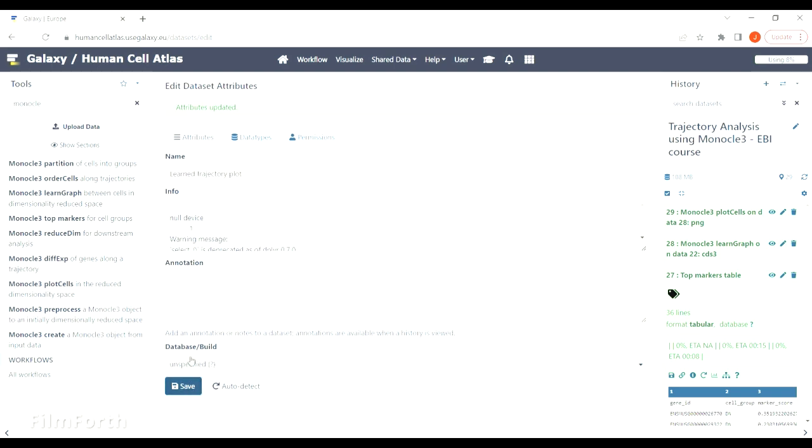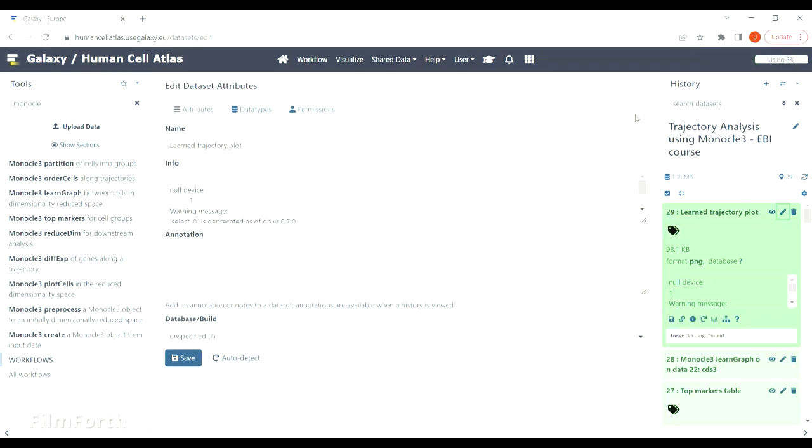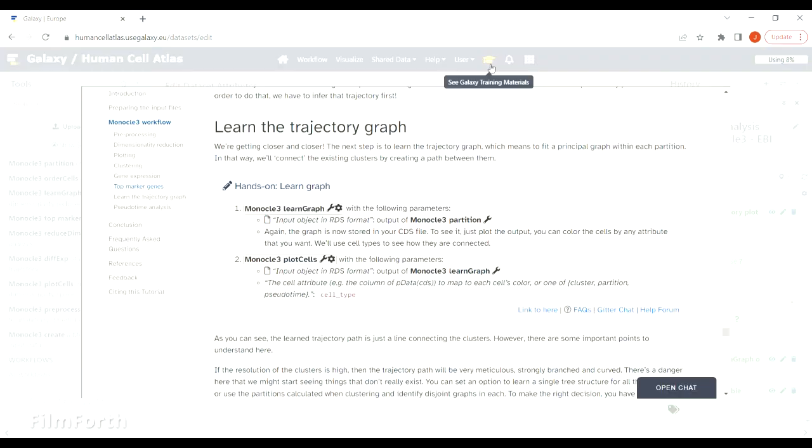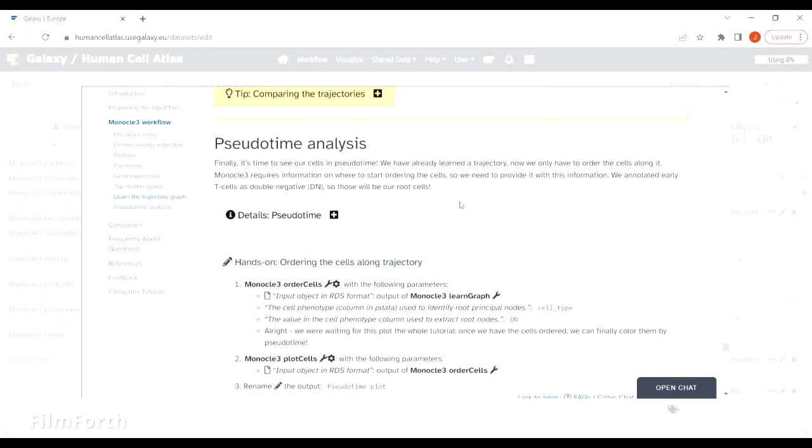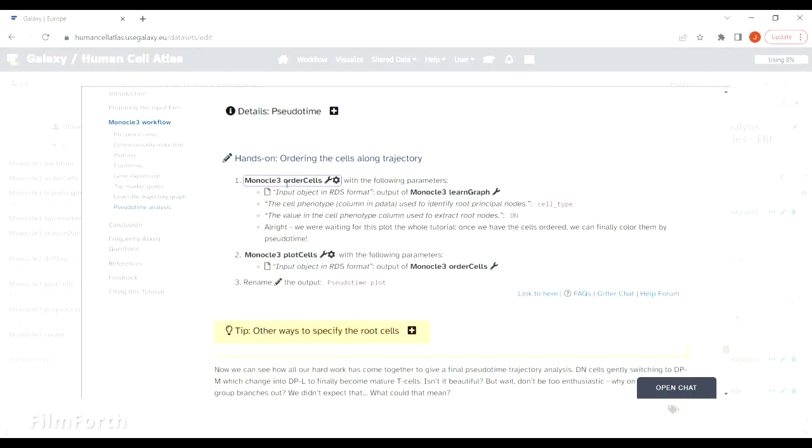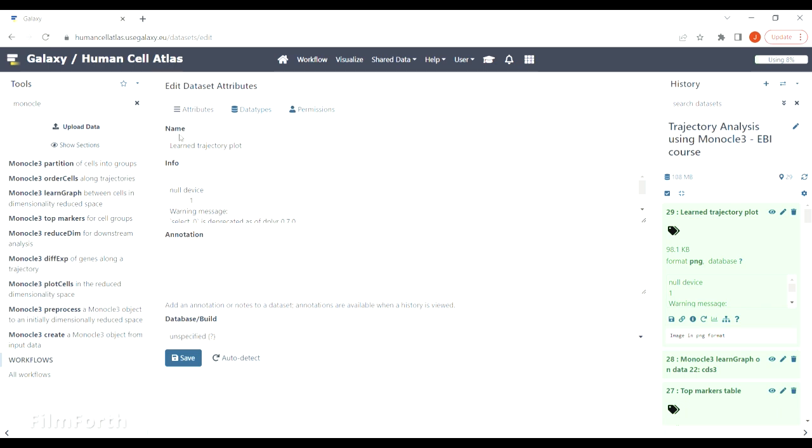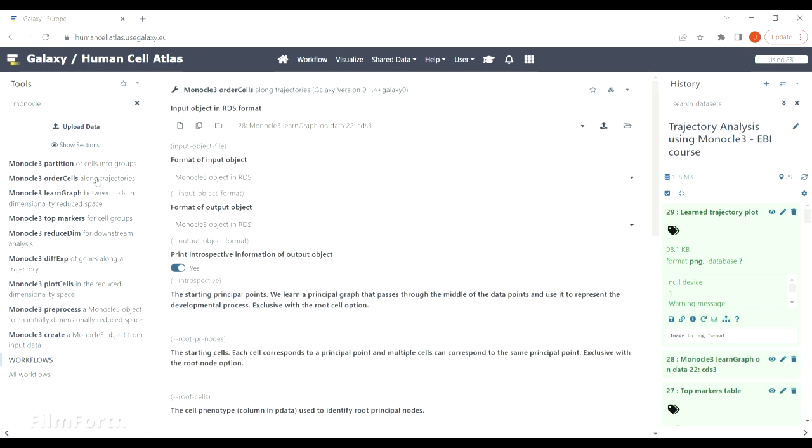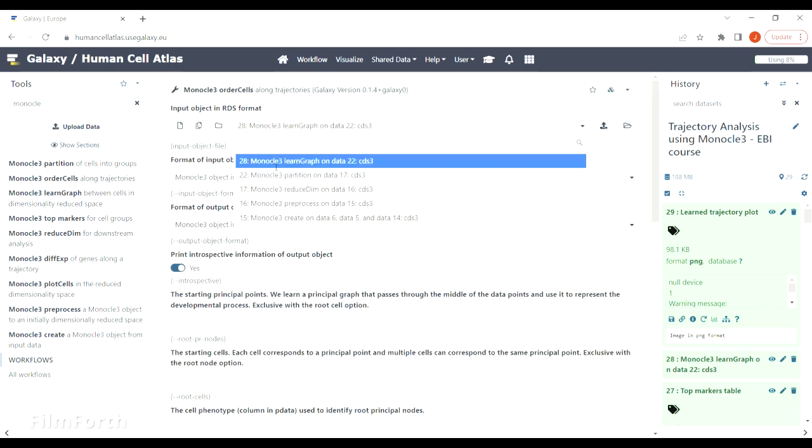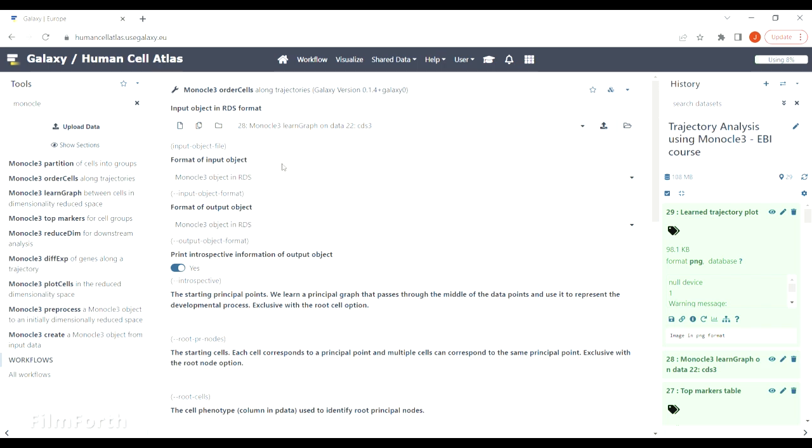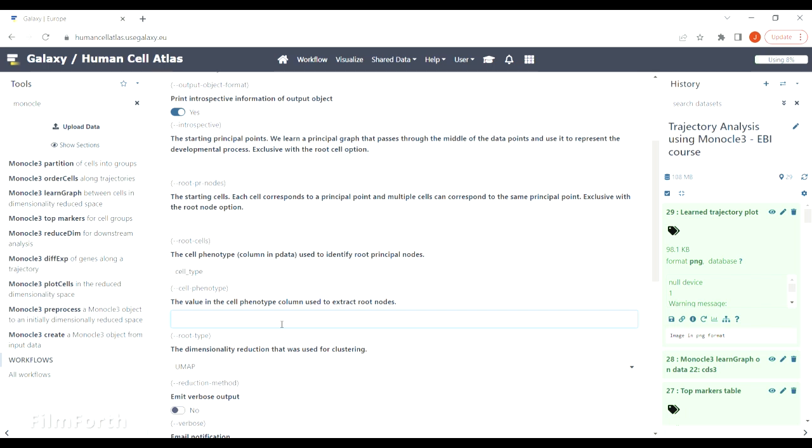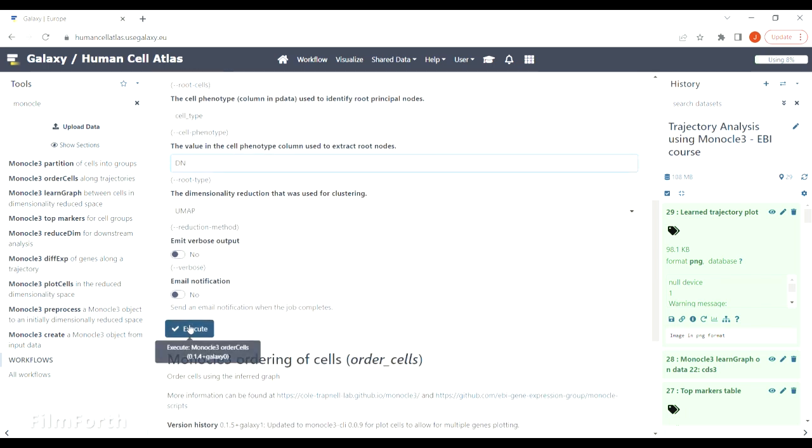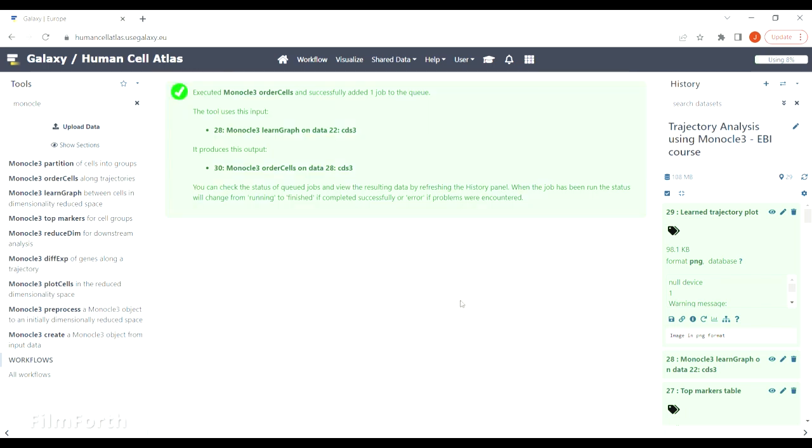We will need it to order the cells along this trajectory. To do so, we will use order cells tool and visualize the output in pseudotime. To order the cells, Monocle needs a starting point. You can specify the starting point in different ways, but we will use double negative cells as starting point. We know that they are stored in cell type column, so let's just type in those values.